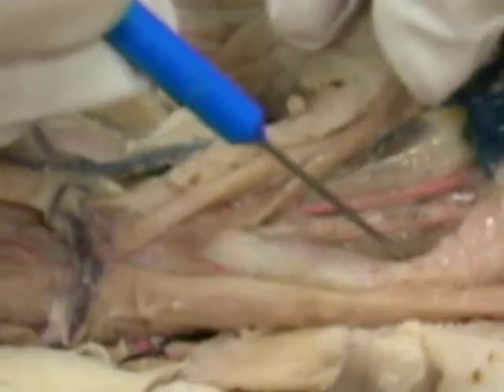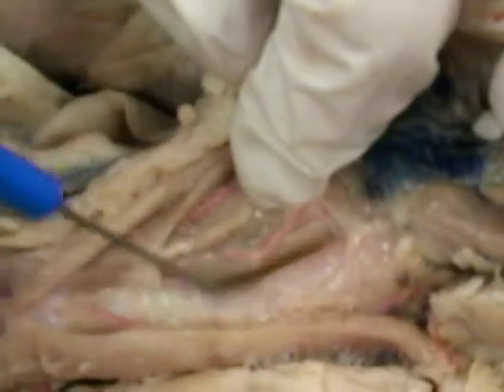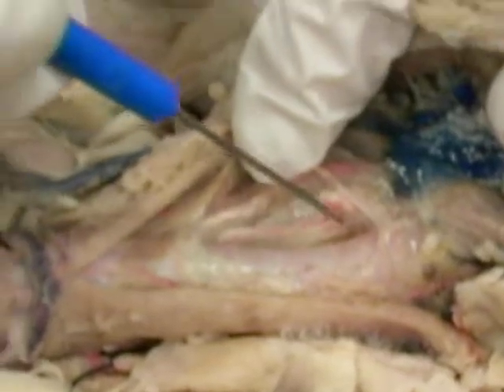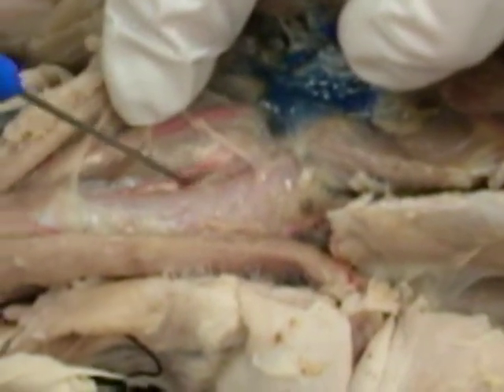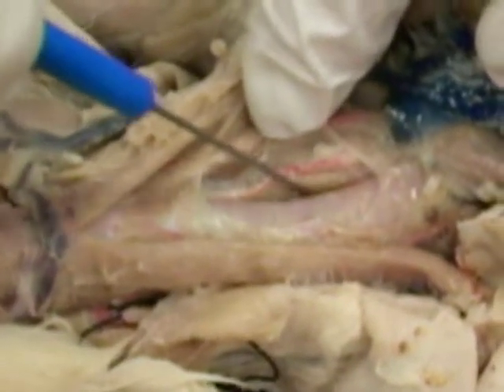Yippee. Overzealous on cutting the poor cat open. Okay, so we're looking for the esophagus, which is going to be the little flattened bag. Yours is miscolored a little bit. It's kind of a greenish looking thing, but it's flat. It lies right beneath the trachea. So that's this. If you want to clean that up later, I'm not going to spend time. So this right here, esophagus.